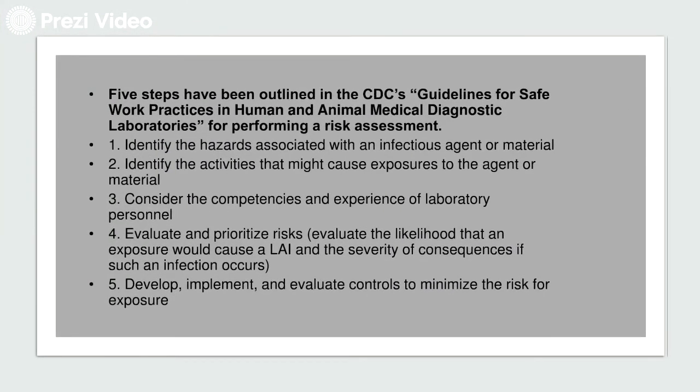So, what are the 5 steps that have been outlined in the CDC guideline for safe work practices in human and animal medical diagnostic lab for performing risk assessment? So, una muna, identify the hazard associated with the infectious agent or material. Second is, identify the different activities that might cause exposure to the agent or material. So, in-explain ko na to kanina, di ba? Identify the hazard, and identify the activities or the process.